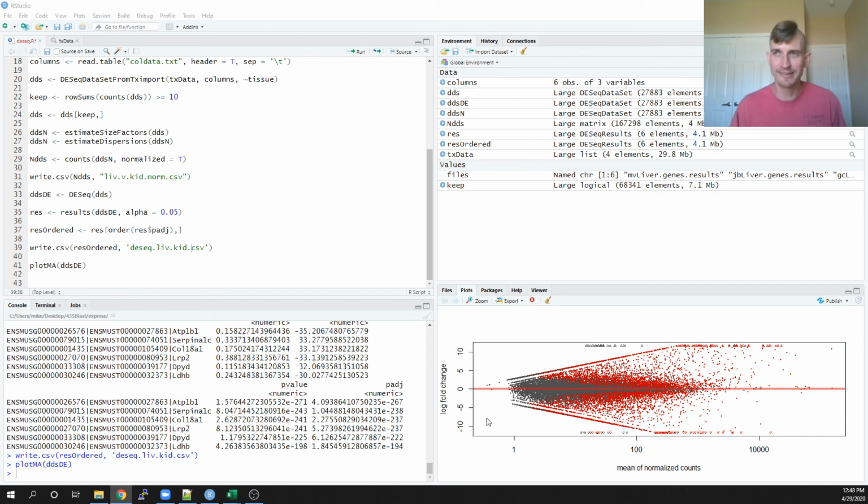And whenever you do this for the same tissue and just do some kind of experimental treatment, you won't see this many red dots, right? The only reason there are this many red dots is because we're using different tissues. And of course, they're different tissues. Of course, they're going to have different genes expressed. But if we only have, say, 20 genes, then we can actually look at what those 20 genes are, what pathways they are in, what their functions are, and see if we can find any pattern that's linked to our experimental design.